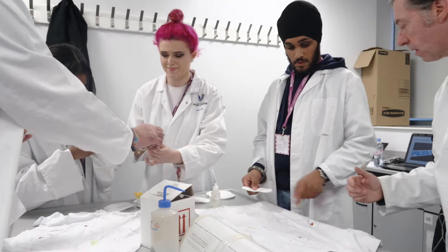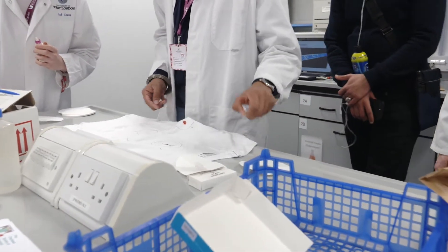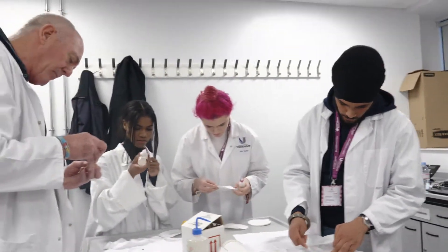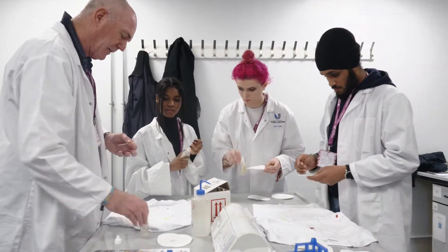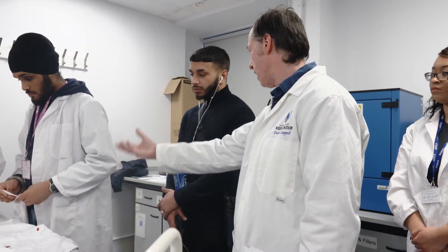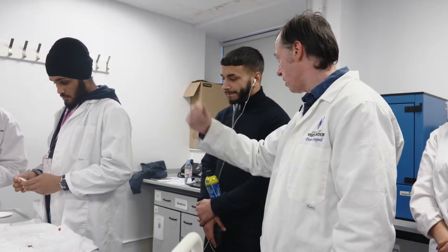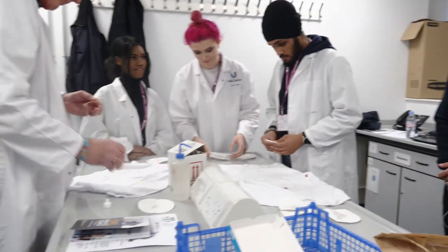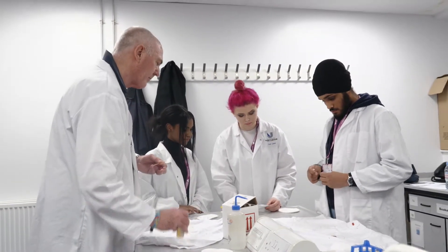Which stain was that? You would think that was blood, wouldn't you? But it's not — it could be very fresh blood, because blood gets darker as it oxidises, goes brown. So it could be like coffee — you can't always tell which one it is. Number three is a peroxide, so that oxidises the haemoglobin and then reacts with number two to give the colour. That's why you shouldn't see the colour after the first or second solution alone. Things like bleach can give a false positive because they also oxidise.